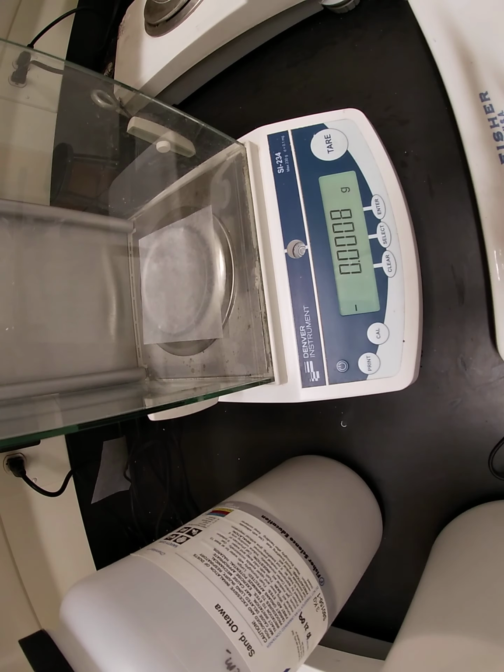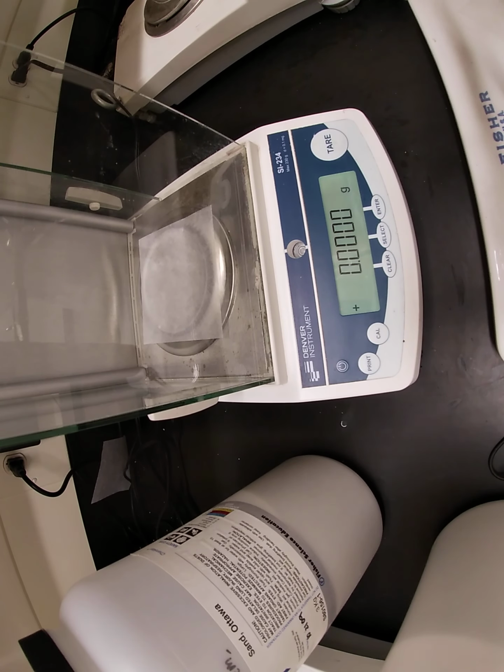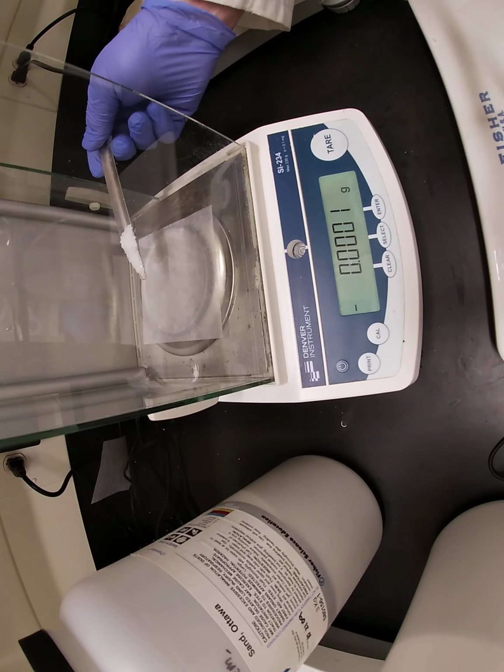It's an organic substance. As I put it on our weigh paper, I would like you to not only record the weight, but what it is that you're seeing. What does it look like to you?